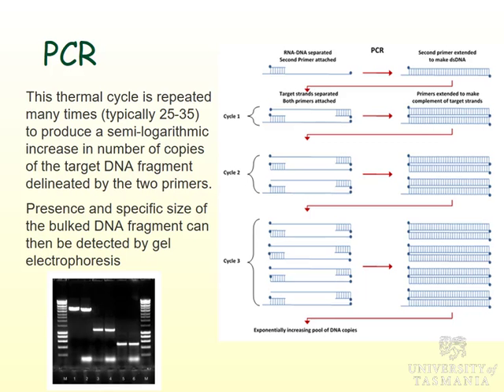We know exactly what it is because we know the genome we're looking for, and these primers are designed for that. Then we can run a gel and look for the presence of the right size. So here we go, we've run a gel, and here we've got big bands, so that's probably about 1,000 base pairs. These ones here are probably about 500 base pairs. These ones here are probably about 200 base pairs. So for diagnosis, we design our primers based on the genome of our target organism, so we pick primers that are specific for our target organism.